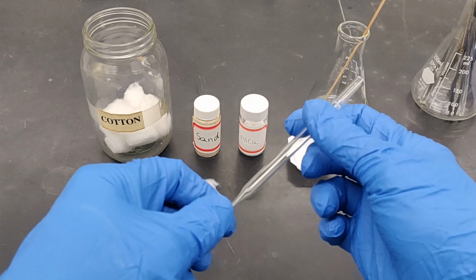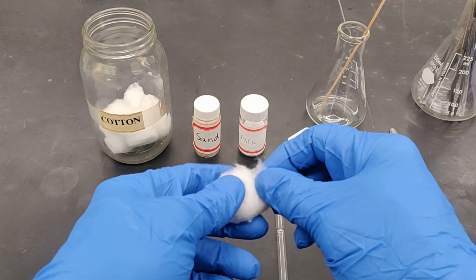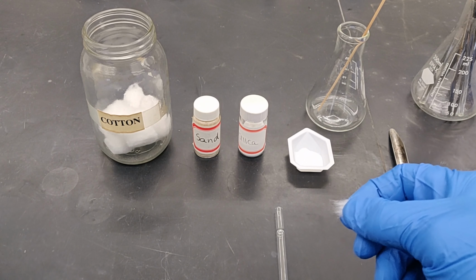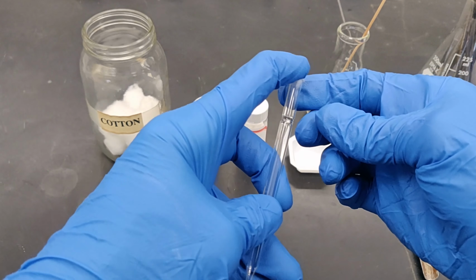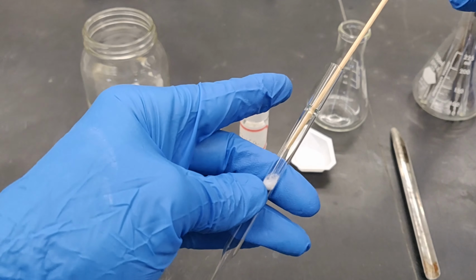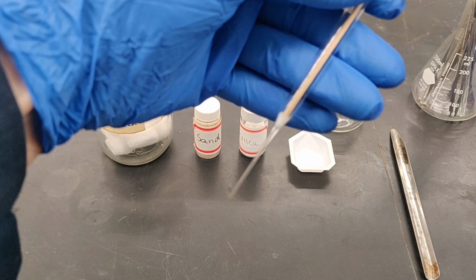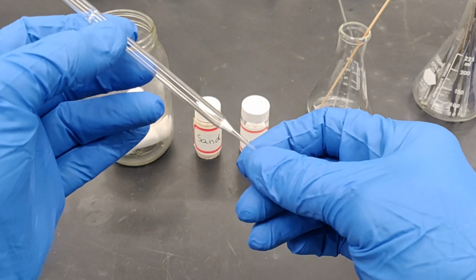A short pipette microcolumn is used for this relatively small-scale separation. Insert a very small plug of cotton into a short-stemmed Pasteur pipette. Use a boiling stick as a probe to lodge the cotton where the pipette narrows. Do not pack it too tightly, otherwise the flow of liquid from the column will be very slow.